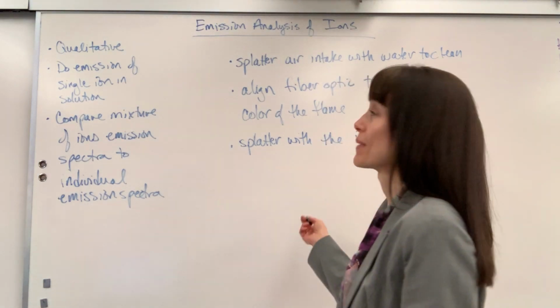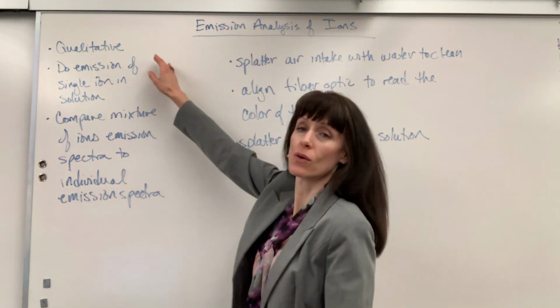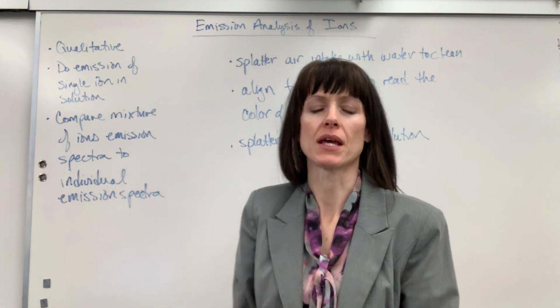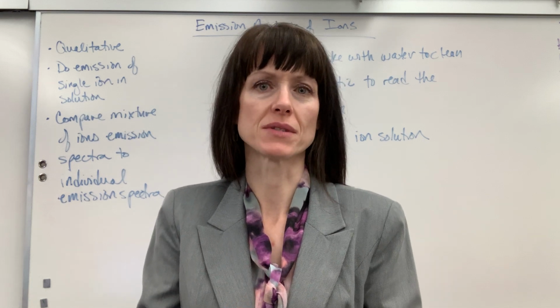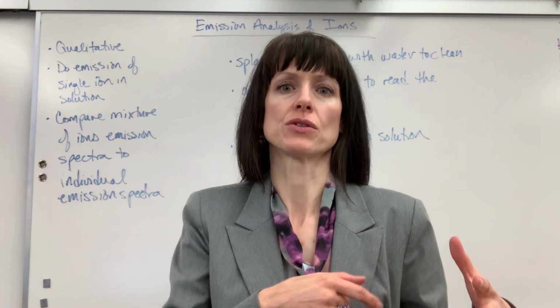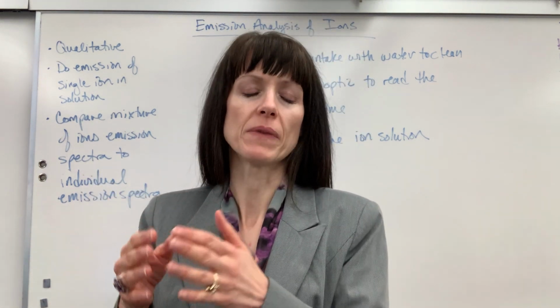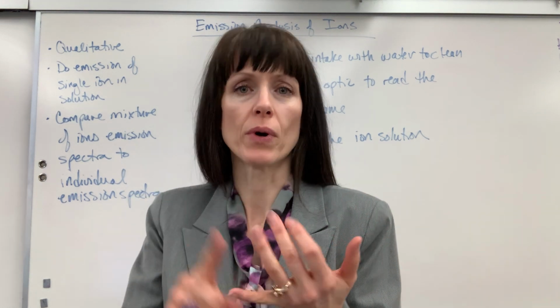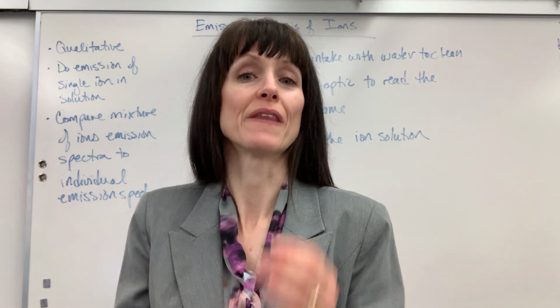Hi, we're going to talk about another lab today. It's emission spectra. Now this is purely qualitative. You're going to take pure ion solutions like a sodium solution. So maybe you've dissolved sodium nitrate in water, or you've made just a solution of potassium chloride. You're going to take these individual solutions of group 1 and group 2 ions, okay? And you're going to test them to get their emission spectra.